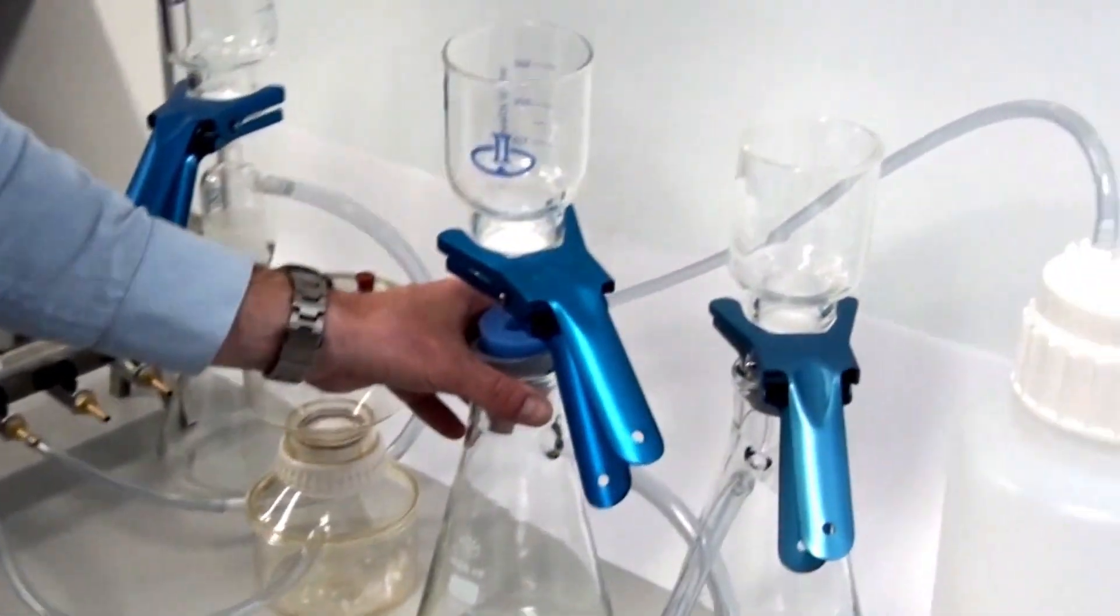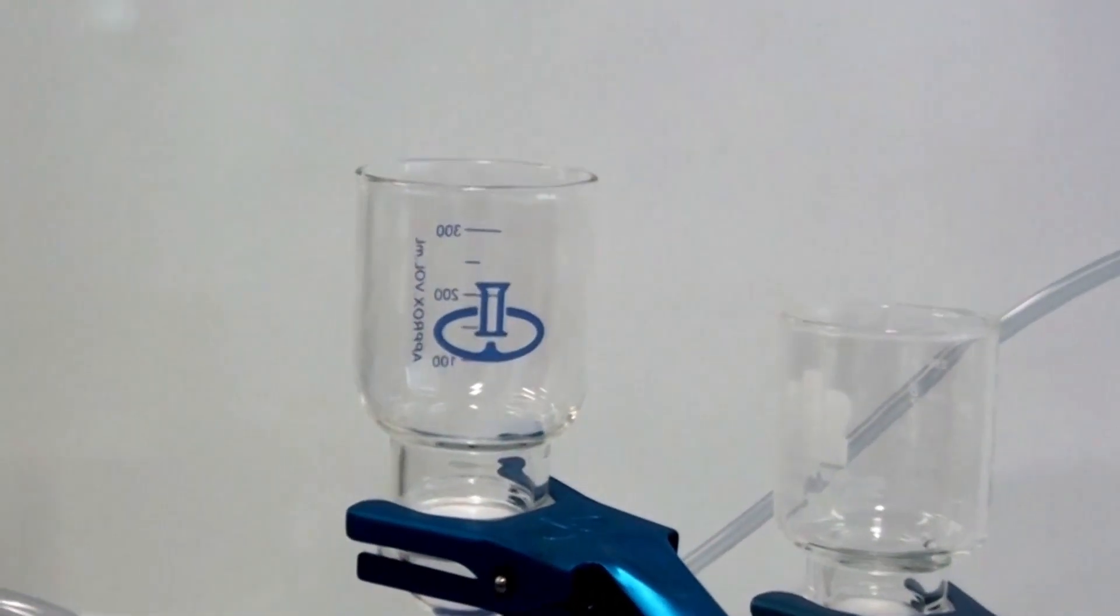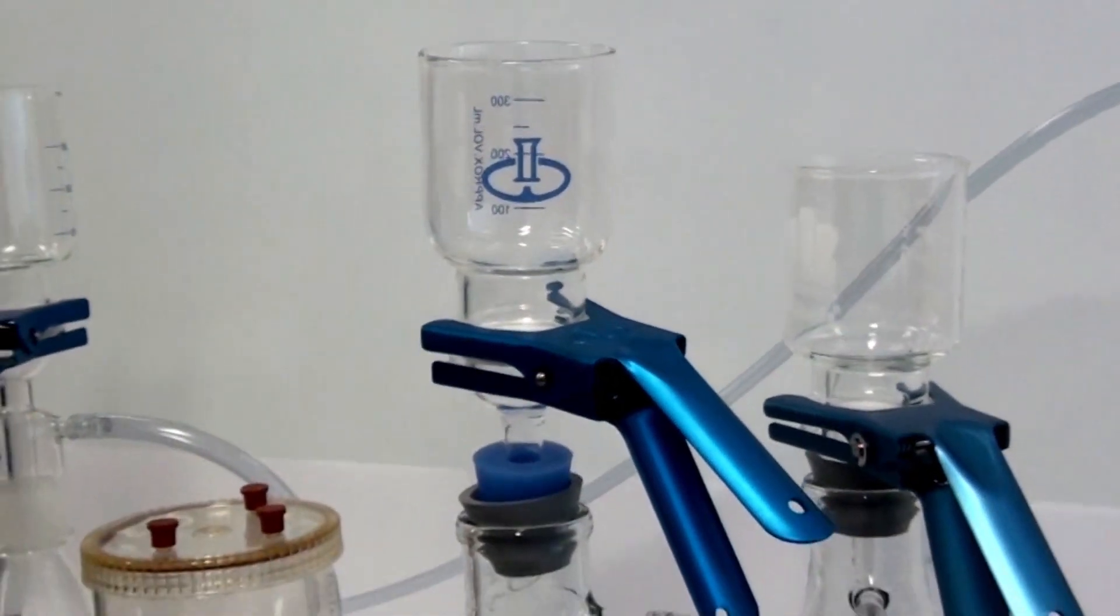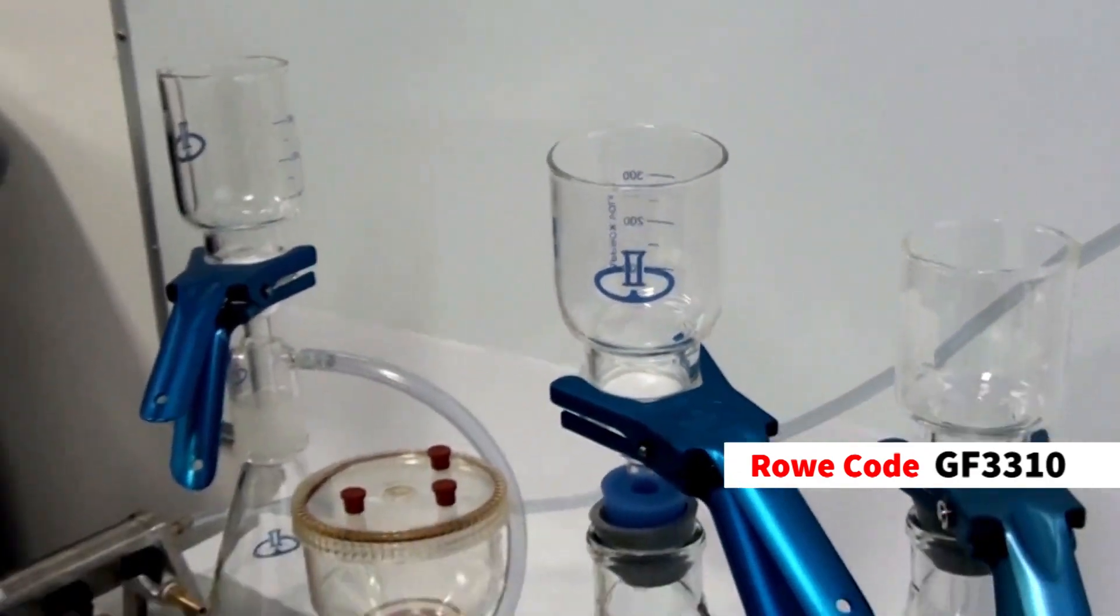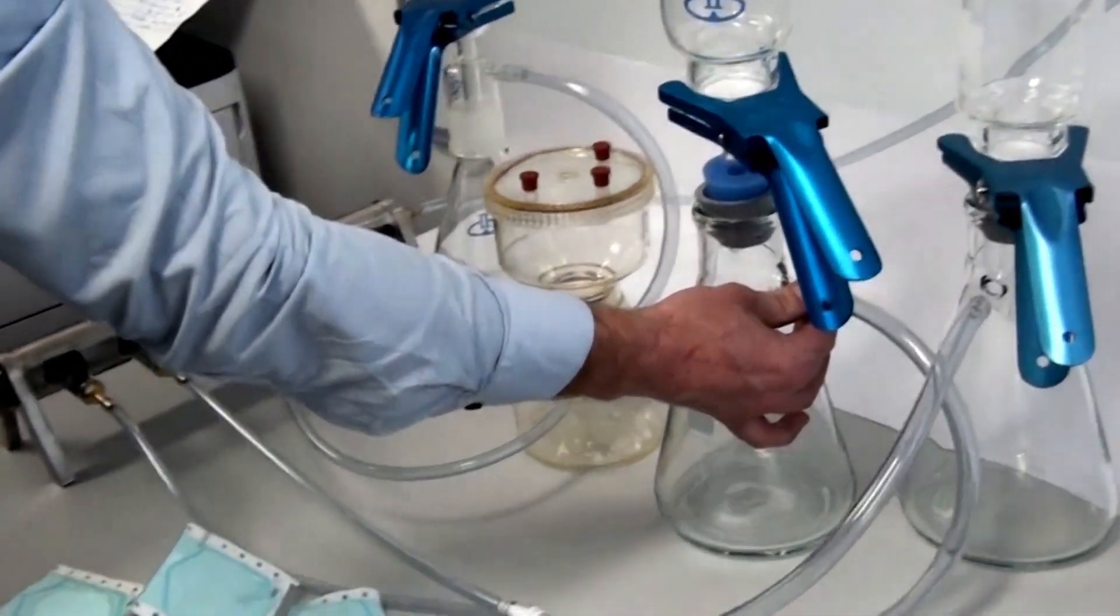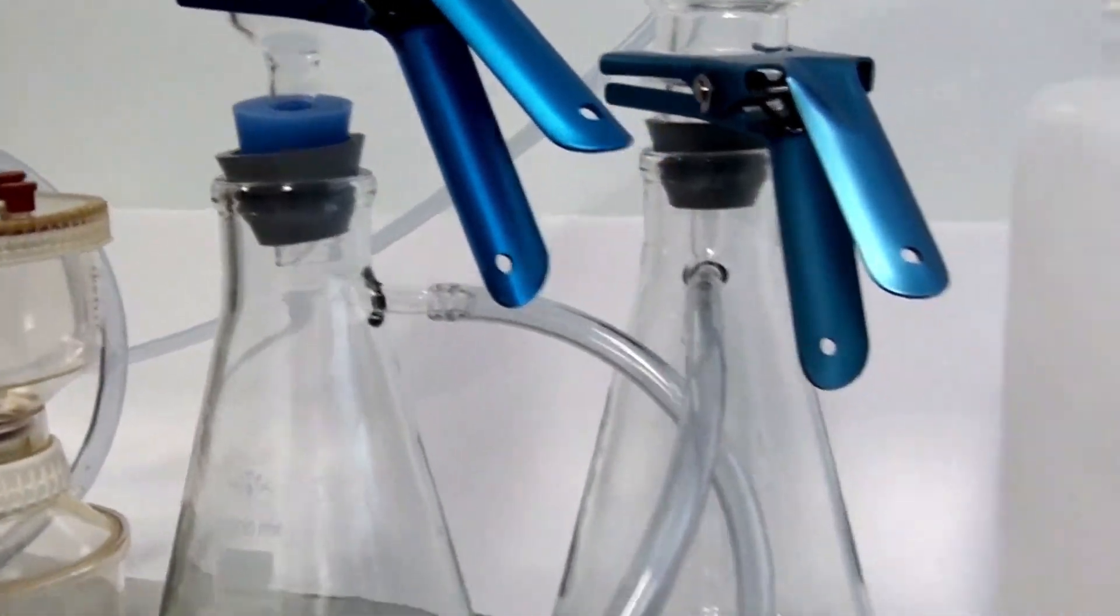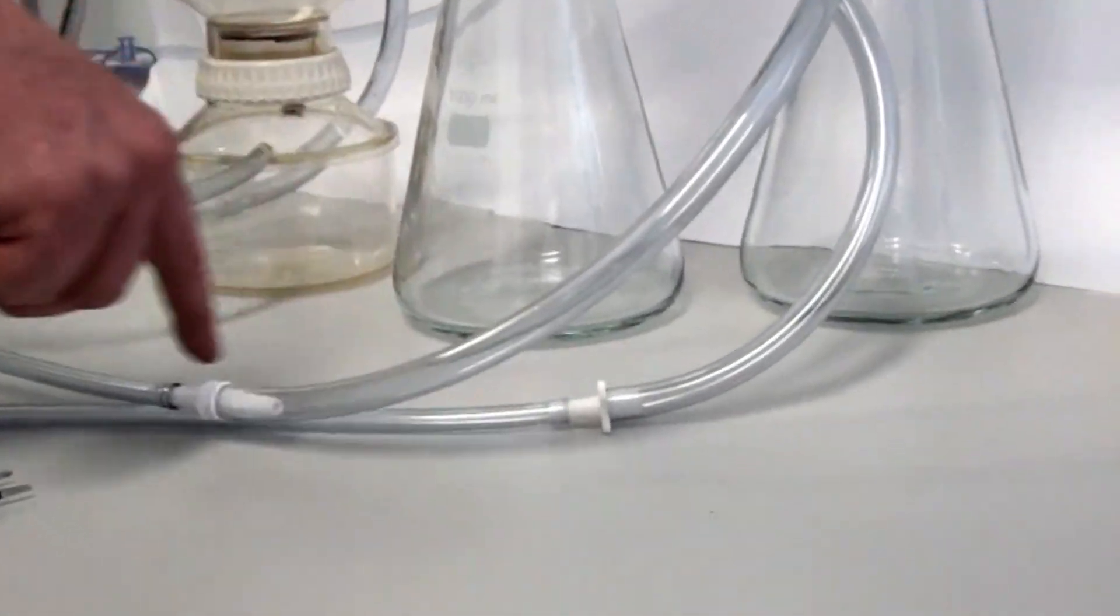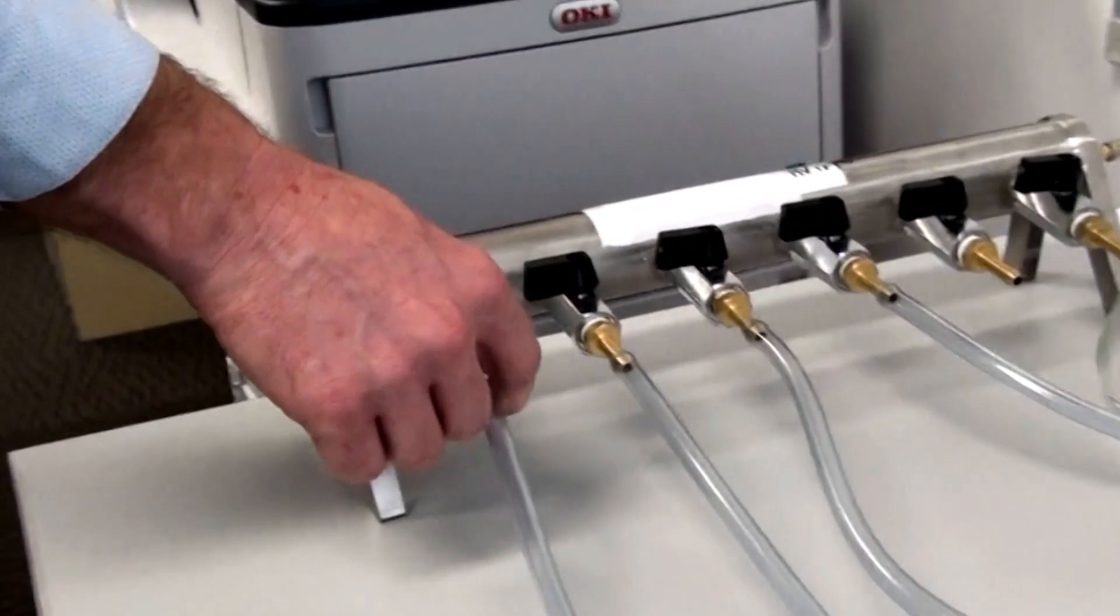Now, next on the line, we have the Synax 1.0L filter flask, which is our code GF3310. And again, that's got a 10mm side arm. So I've connected that to the PT2900 tubing through a connector through the PT2800 tubing to the manifold.